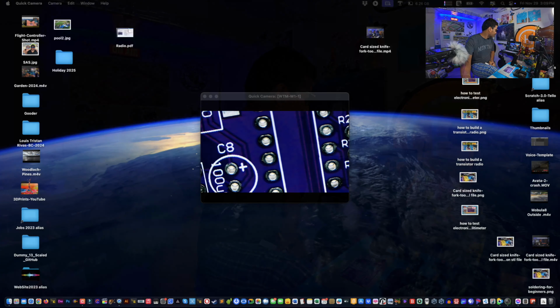Anyway, I hope this video helped you in moving forward so that you too can streamline your experience when connecting a microscope to your Apple computer, or even another camera, an external camera. As you can see, the cameras work too from the internal and anything that's connected, so it won't be flipped out. So it looks like this, right? But you want it to look like that.